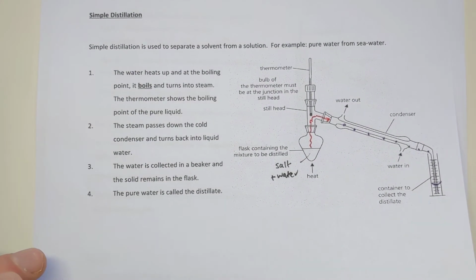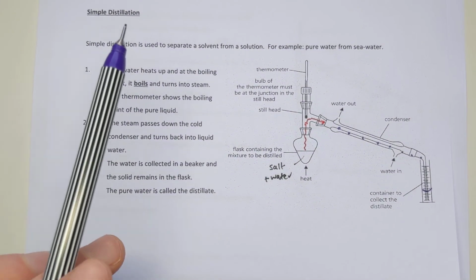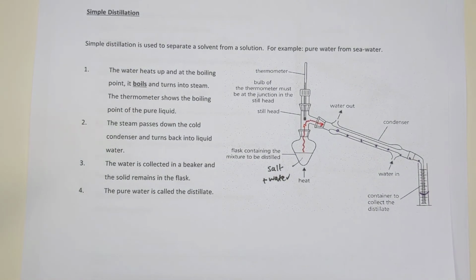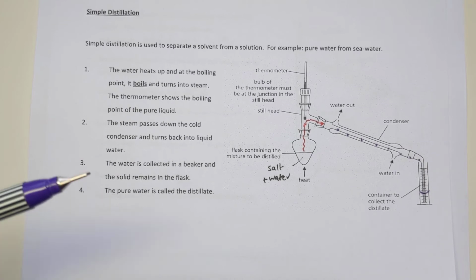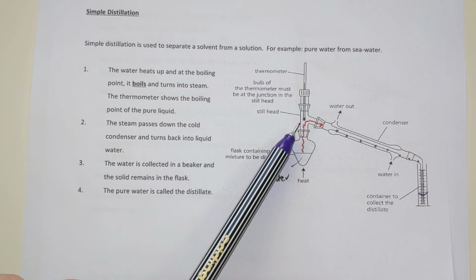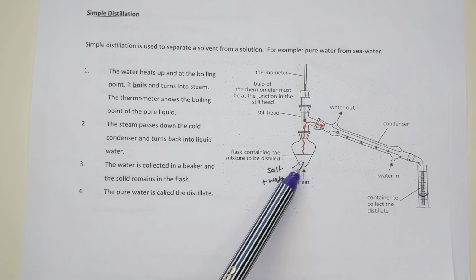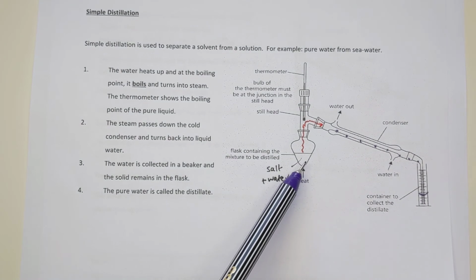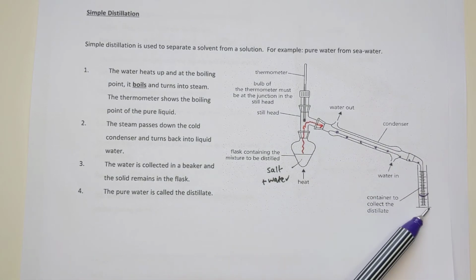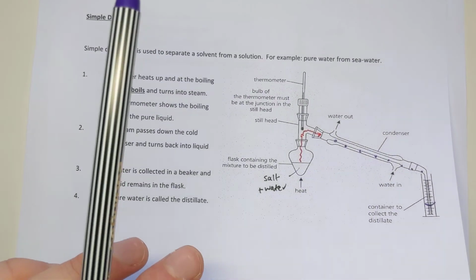There's only actually one difference. The problem with this apparatus here, simple distillation, it wouldn't work that well for separating ethanol and water. The reason it wouldn't work that well is the issue is when you heat up a mixture of liquids, in theory you should get a good separation of the ethanol boiling first, then the water boiling second. In reality, it's quite easy for them both to boil at the same time. They've got quite close boiling points. If I did it with this apparatus, what I probably would get at the end is the same mixture in this container at the end. In other words, they would both kind of boil off together.